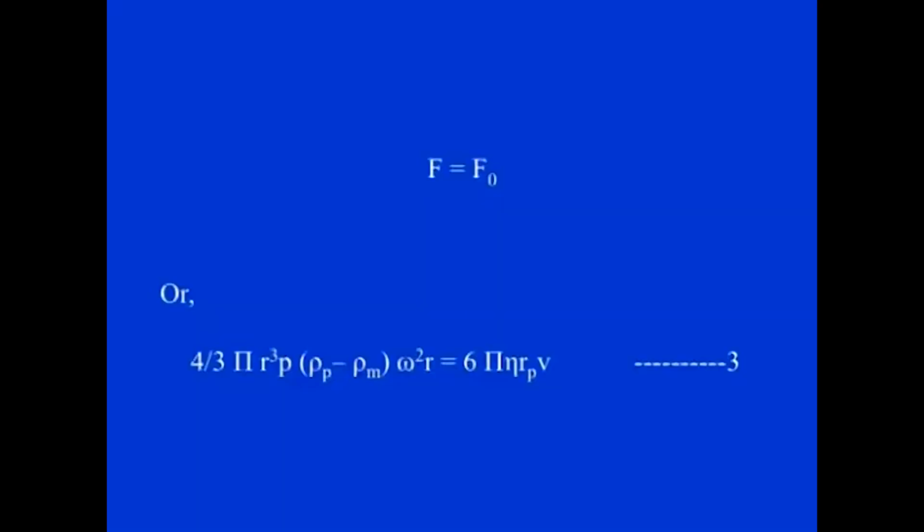So, then you have the forward force due to the applied centrifugal force, which is experienced by the particle, and the opposing force, which is the frictional force. These become equal. So, the values for both could be substituted in here for the frictional force when you would like to calculate the velocity or rate of sedimentation. The balancing of these forces occurs very quickly, and the result is that the particle will sediment at a constant rate, achieving constant velocity after a certain period of time.